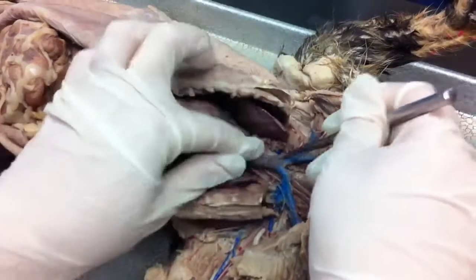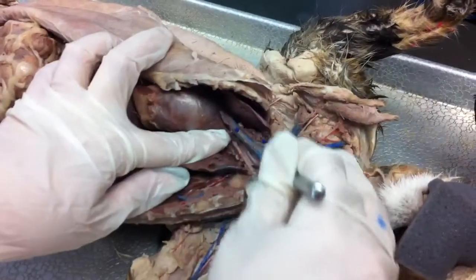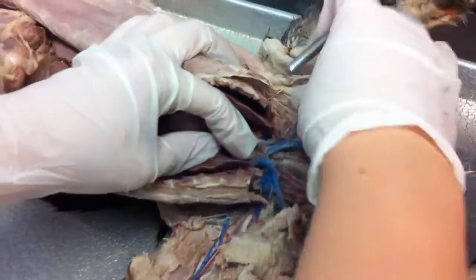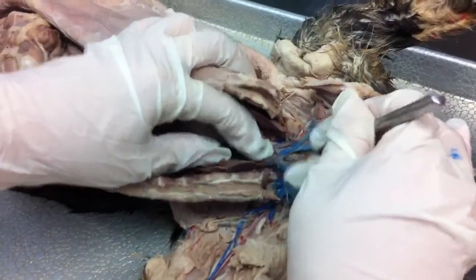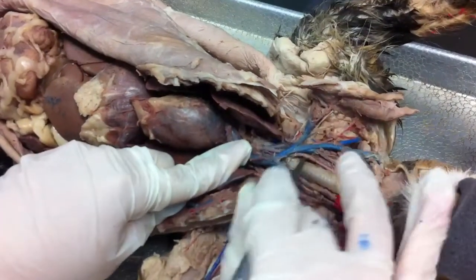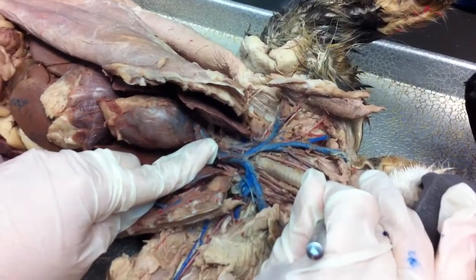The right subclavian artery comes off the brachiocephalic. So the right subclavian artery, it's only this long. The left subclavian, on the other hand, is about 3 times as long, comes directly off the aortic arch. Okay. So right subclavian, and then you would have axillary and brachial, but they're not dissected. Okay. So the middle one that comes off the brachiocephalic, this one right here, comes up the right side of the trachea. This is the right common carotid artery.